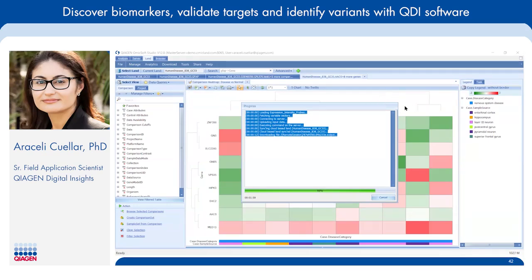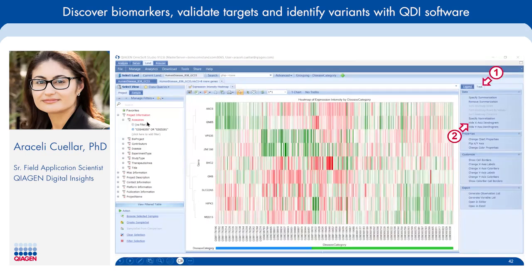In the meantime, Kristen, if there are any questions that I can answer without showing anything, just let me know. Sure. A couple of questions. One came up while you were showing those filters on the left-hand side. Some of those were showing up as red fonts. What is the difference between the black fonts and the red fonts on the filters?